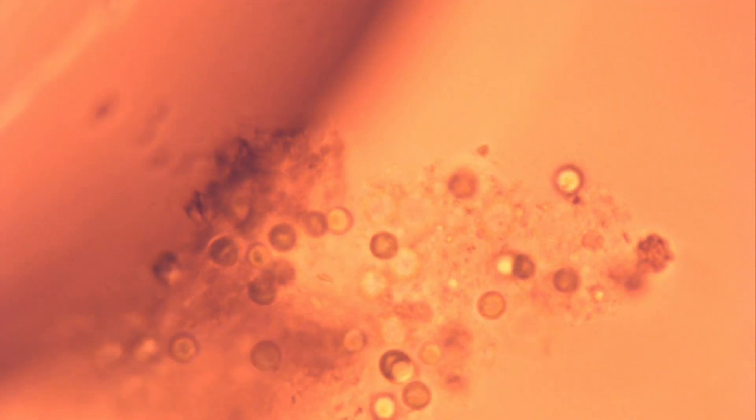This drop is not completely sterile, some life still remains. Peroxide is an antiseptic, but doesn't work as well as alcohol.